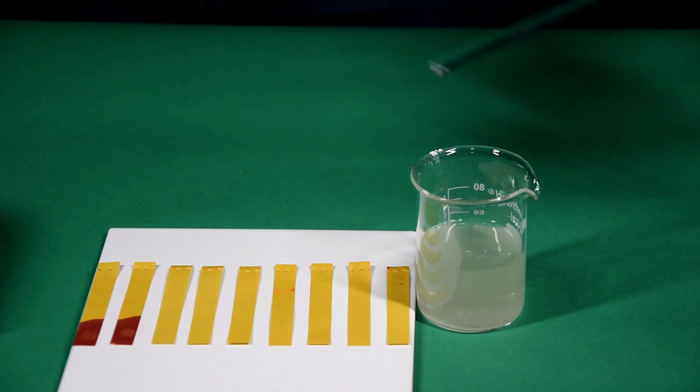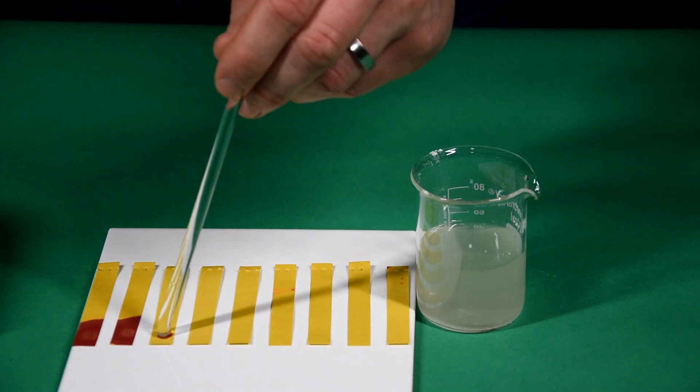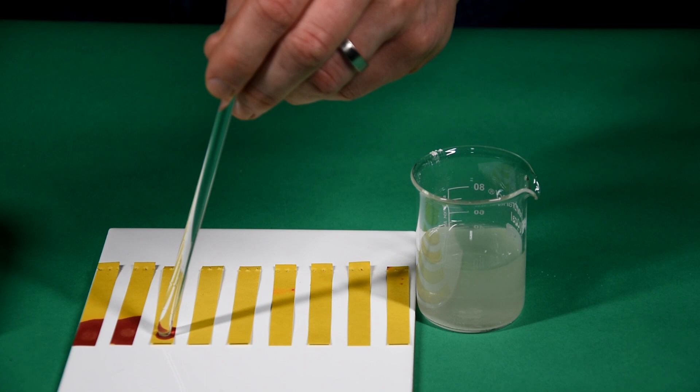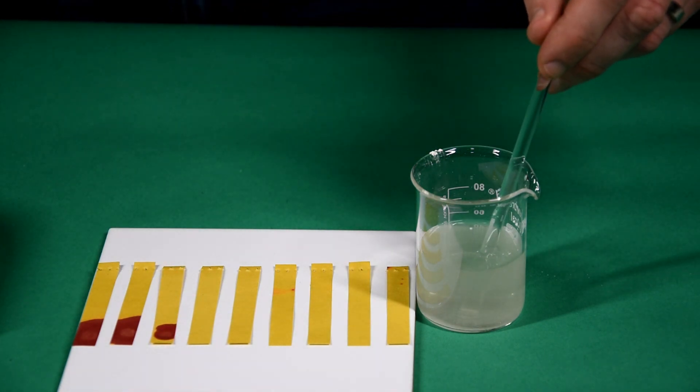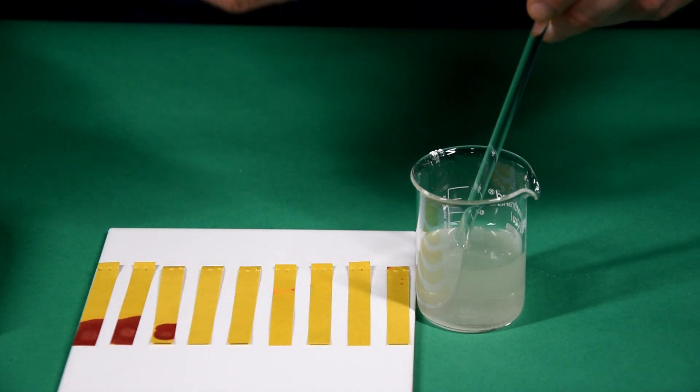Use the glass rod to add a drop to the third sheet of paper. The red color indicates high levels of hydrogen ions and a low pH number.